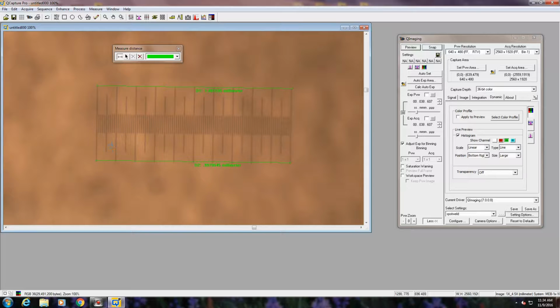And if you need to, in this case, we're going to also check here, a much smaller measurement. Okay, that looks good. And then to put the final touches on it, I'm going to measure the bar that's supposed to be 0.5 millimeters. Again, one thing to make sure of is that you don't have as much angle on it. Okay, that looks good.